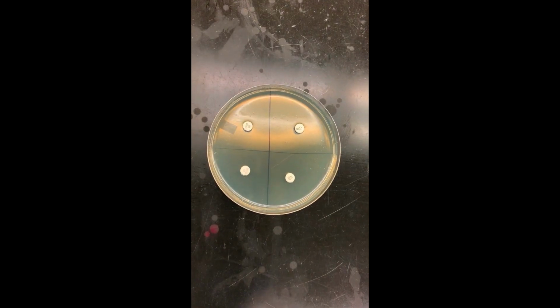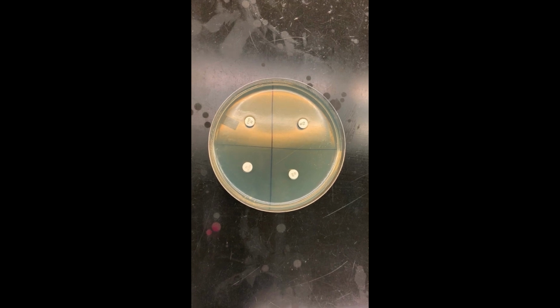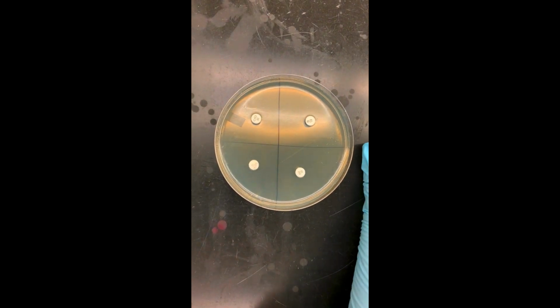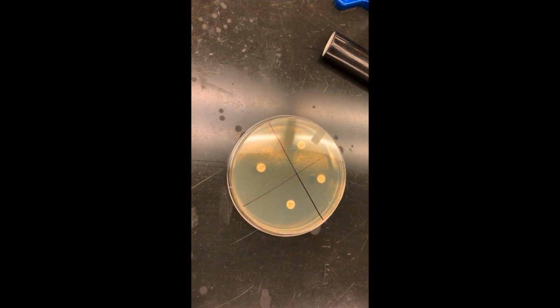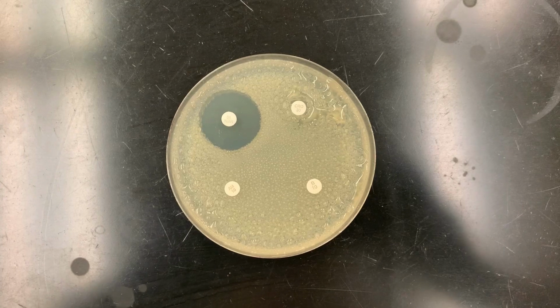And now what we're looking at is all 4 discs on the plate. You can see the names of the antibiotics and their concentrations. We'll put a lid on it, flip it over, and this plate is good to incubate until tomorrow.